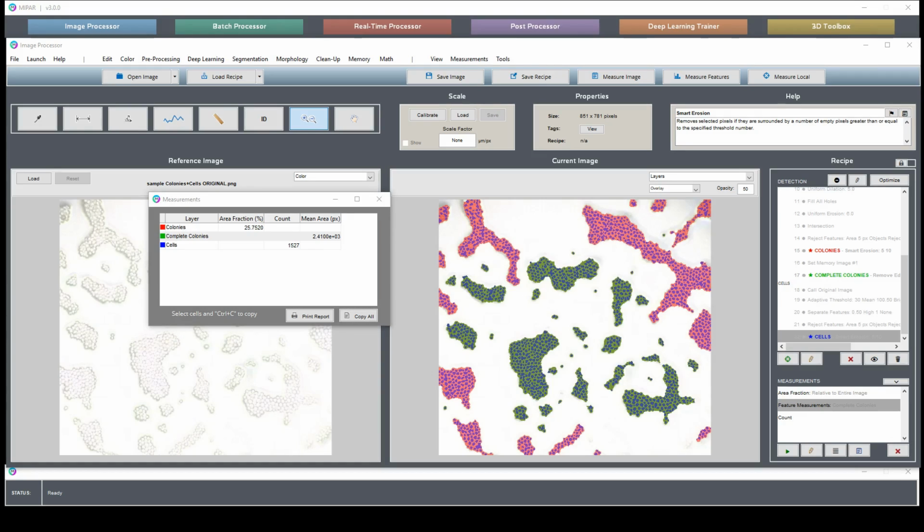Now, the takeaways that I want you to have from this lesson: one, of course, you want to make your original image as good as possible. Be familiar with your instrument, be familiar with how to use it optimally so that you can get the best results. It'll save you a lot of headaches later. And then, when you're using some sort of filter to act on an image, make sure you know the side effects that filter will have and how those side effects will show up with your particular image or set of images.